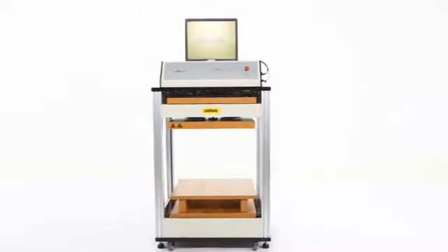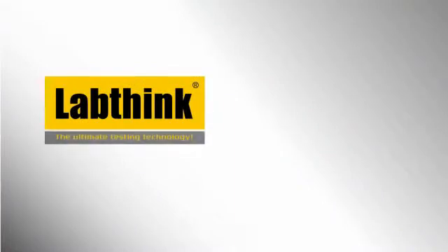iBoxTech 1700 — your best choice for a professional box compression tester. LabThink, the ultimate testing technology.